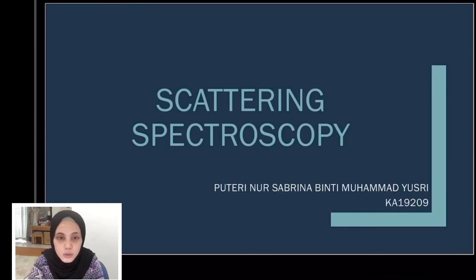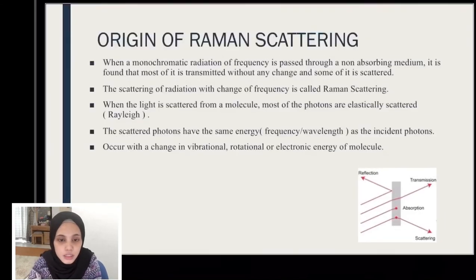We move to the first slide, which is the origin of Raman scattering. When monochromatic radiation of a given frequency is passed through a non-absorbing medium, it is found that most of it is transmitted without any change and some of it is scattered. The scattering of radiation with a change of frequency is called Raman scattering.